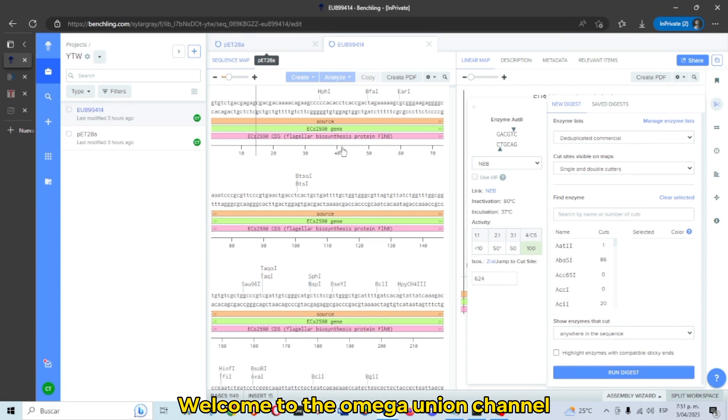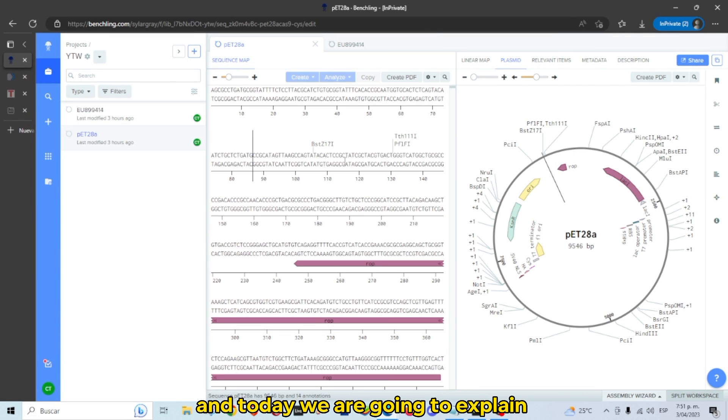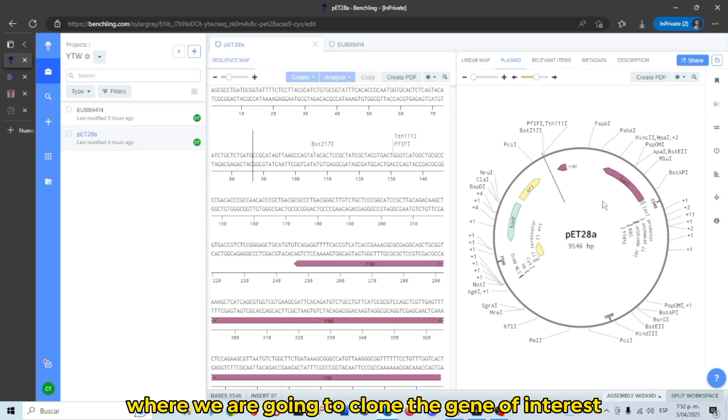Welcome to the Omega Union channel. Today we are going to explain how to design primers using Benchling. We have our plasmid where we are going to clone the gene of interest, and here we have the sequence of the gene.